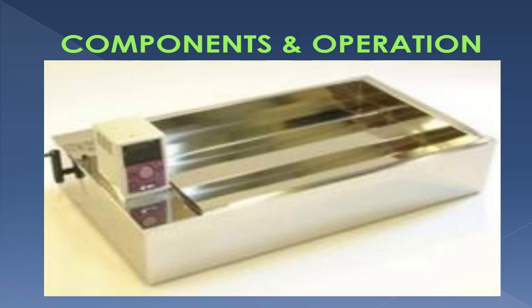The capacity of the Inspissator for McCartney media bottles is about 450 bottles in 3 trays with a single layer of bottles in each tray. Capacity can be increased to 600 by loading more bottles in each tray in 2 layers or in 3 layers.